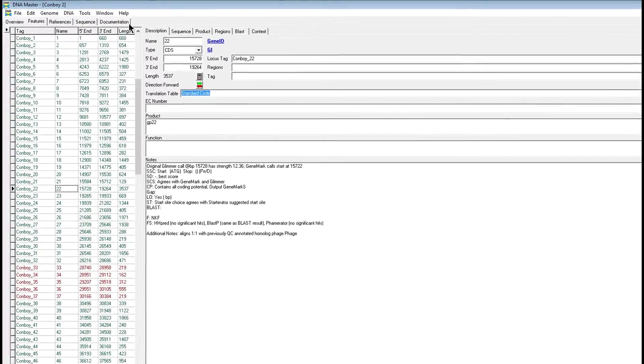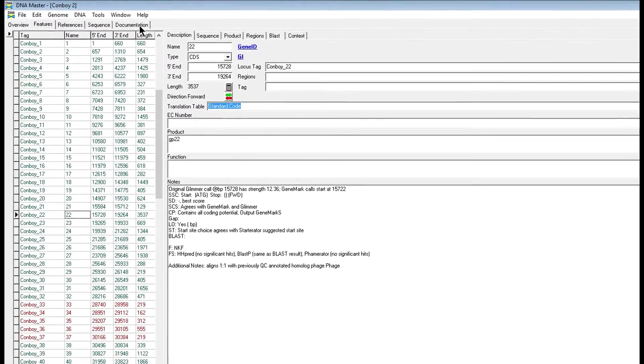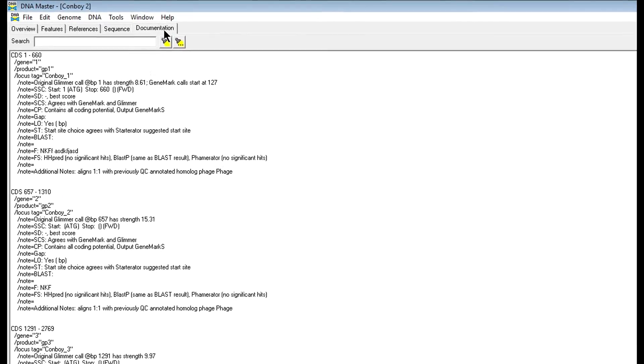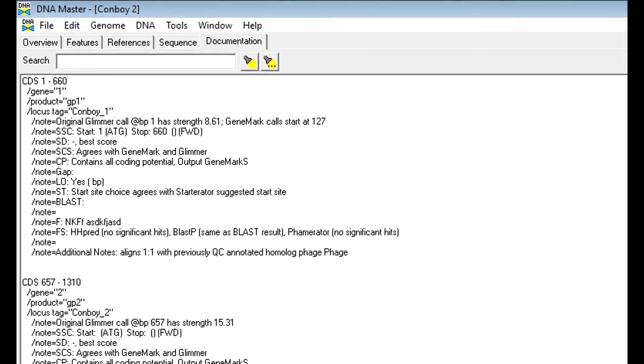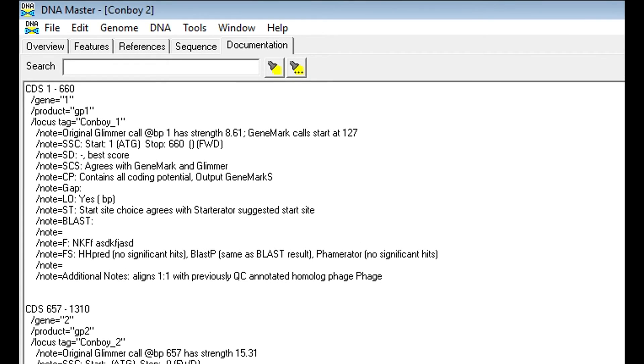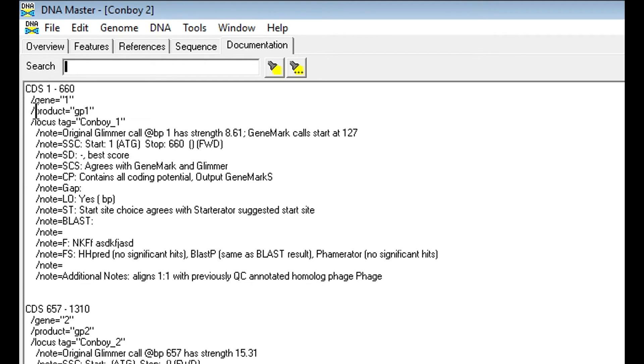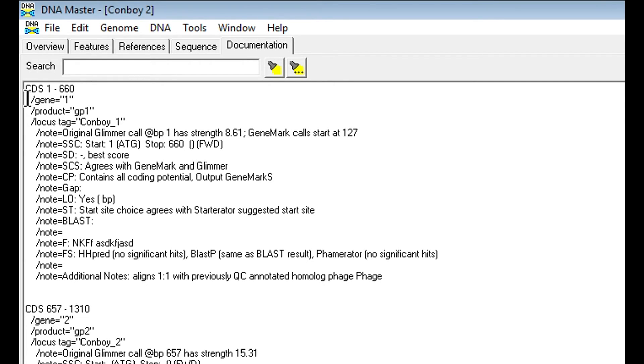Next, we'll move over to the documentation tab. If you watched the last tutorial, you'll know that you have to recreate the documentation each time you save. So you may be a little bit familiar with how this is laid out. But pretty much, you're not going to be working in the documentation tab too much, but it's good to know how it's laid out. This is the coding sequence here from base pair 1 to 660. It's called gene 1, the product is gene product 1, and the locus tag is your phage name and the number.